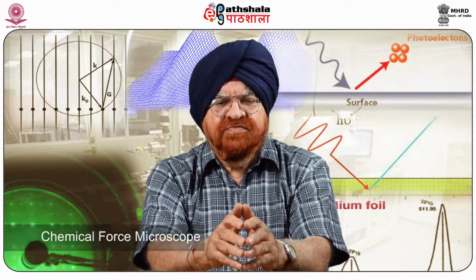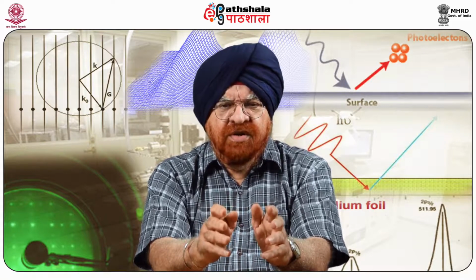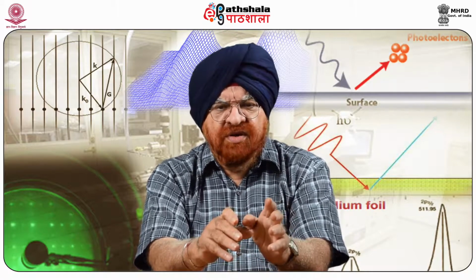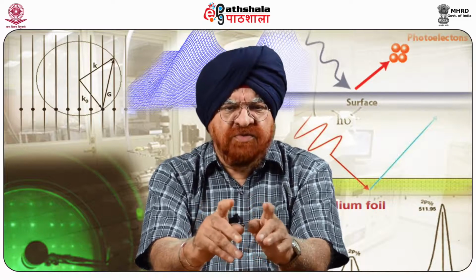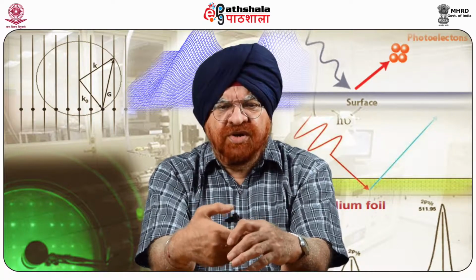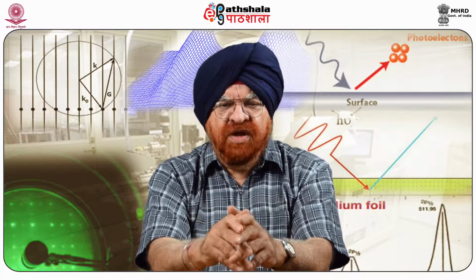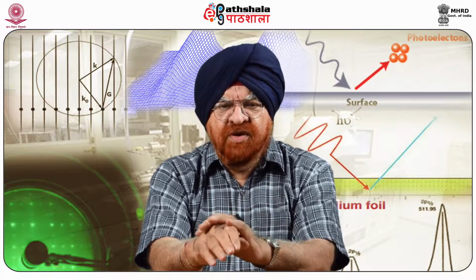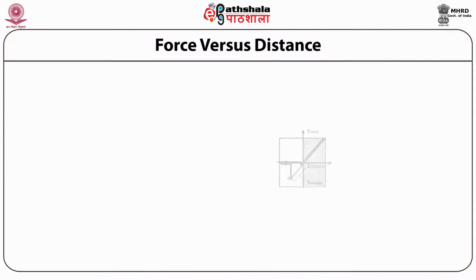Chemical force microscopy analyzes, of course, force and distance. When the tip is placed at a fixed point on the sample and moved in the vertical direction to the surface and then retracted from the surface, in place of scanning, the deflection of the cantilever can be measured as it moves. The cantilever is in the repulsive contact region of the cycle, and the adhesion interactions between the tip and the surface are analyzed. The deflection of the cantilever will provide information on the mechanical properties of the material during the approach and the retraction. Forces versus distance.